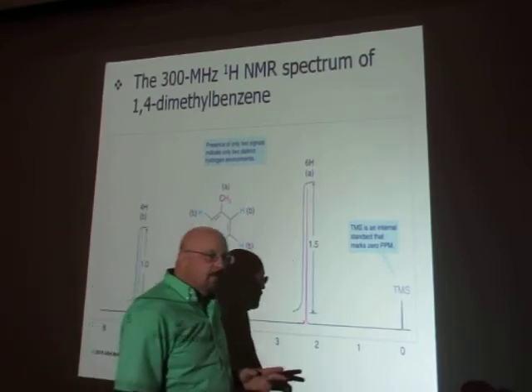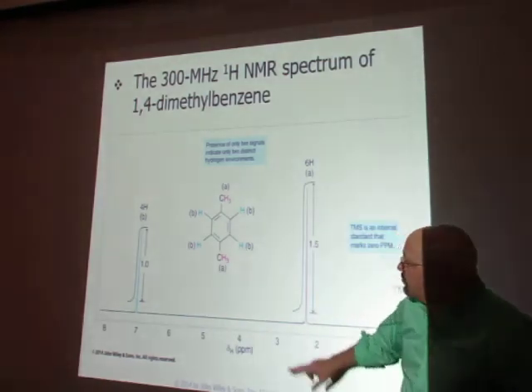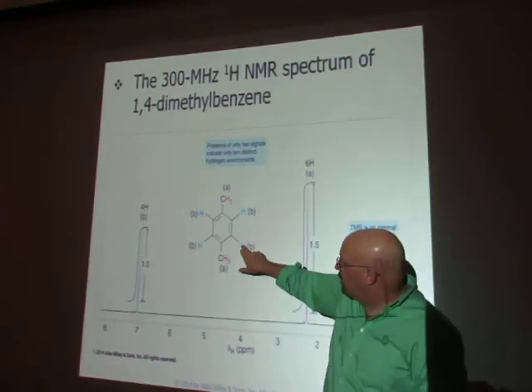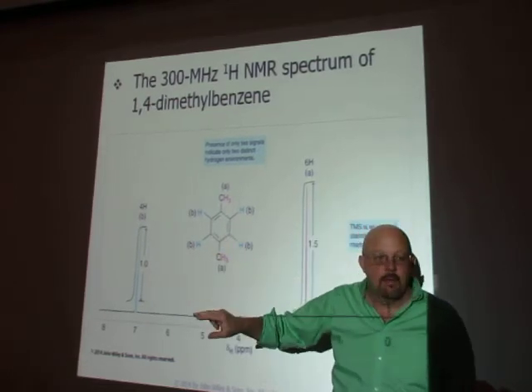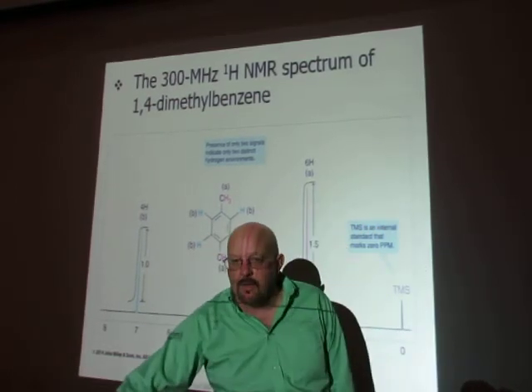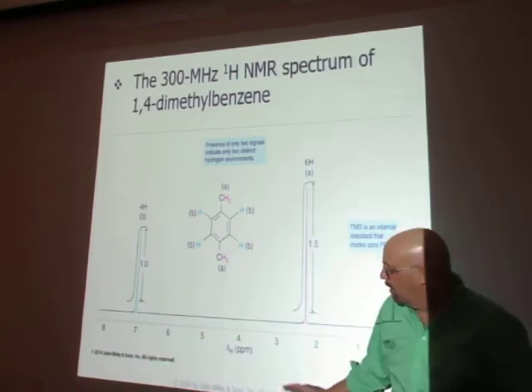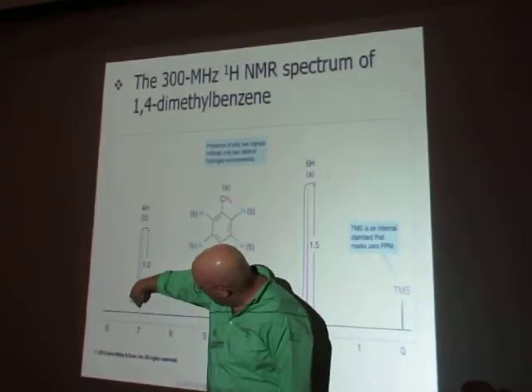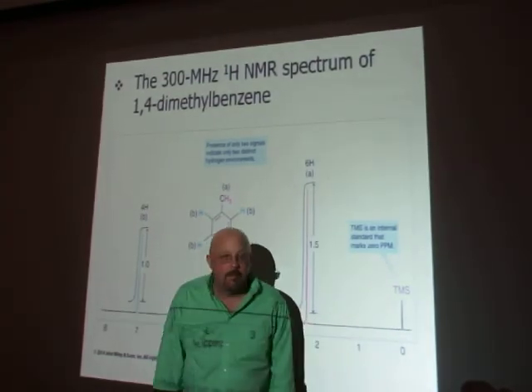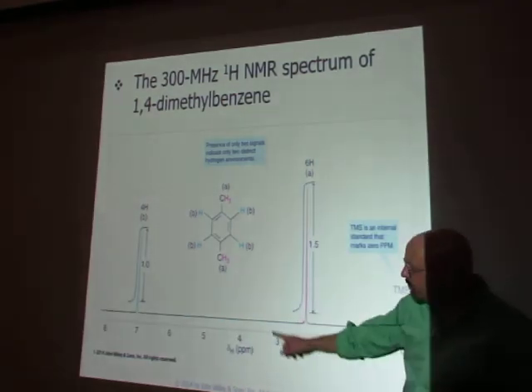Let's look at the chemical shift. So we just talked about the chemical shift. The blue protons are on an aromatic ring. So I said protons on an aromatic ring come from 6.5 to 8. Yep, right there. There we are. It's about 7.1. Perfect. That's our aromatic protons.